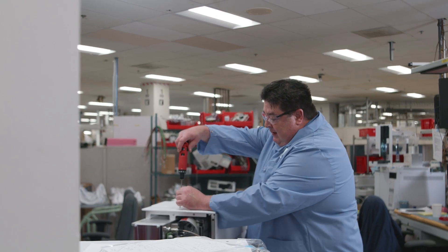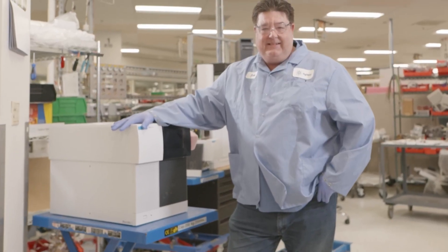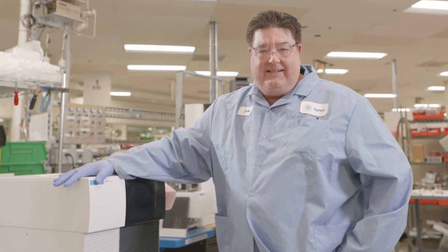Success for me in this position is putting out a quality product. It brings me a lot of satisfaction knowing that I'm sending out an instrument to a lab or a school that will fit into their budget and function at a high performance level.